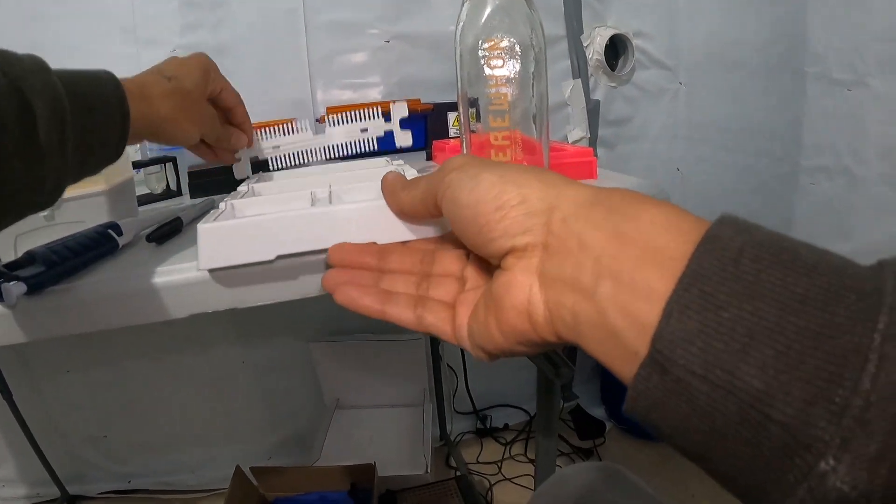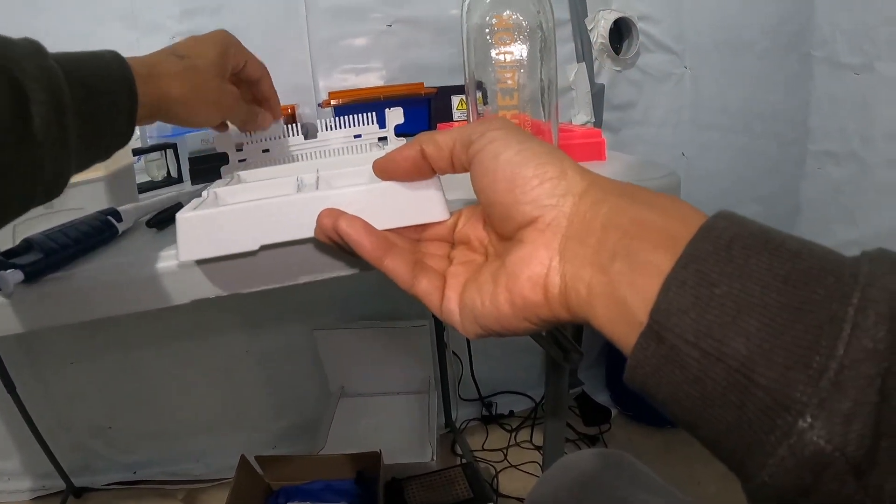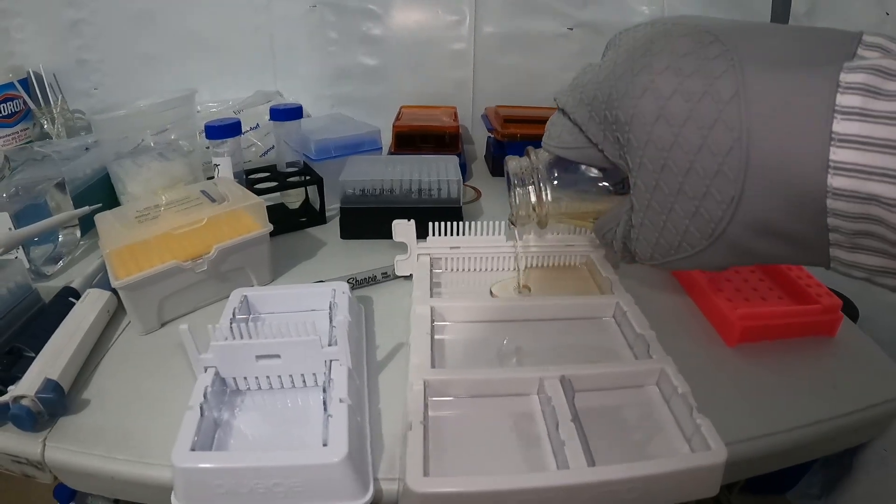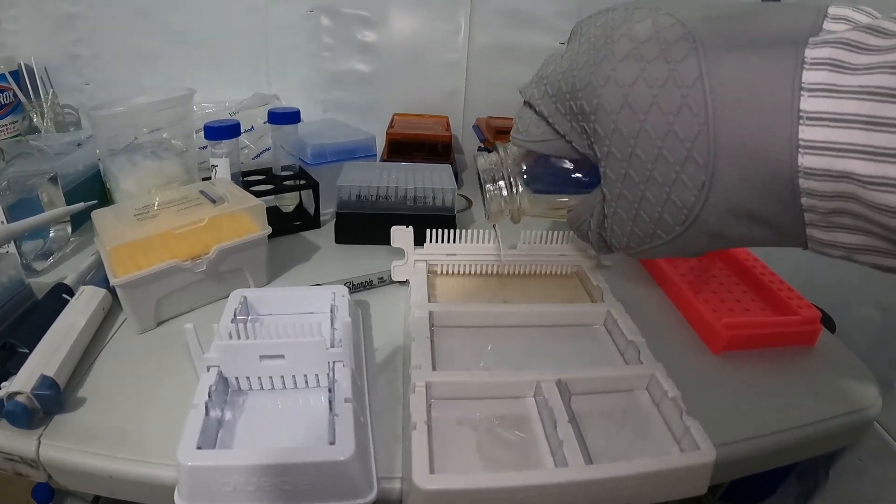I set the combs right into the casting tray — super easy setup. Then I poured the agarose right into the casting tray. The two tabs filled up the bigger casting tray perfectly.